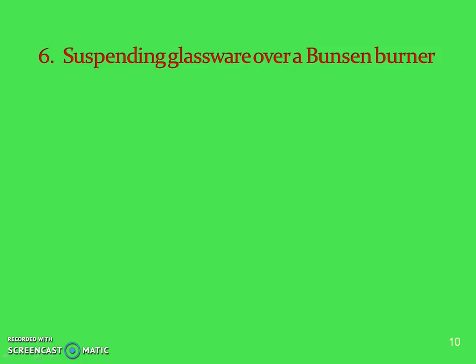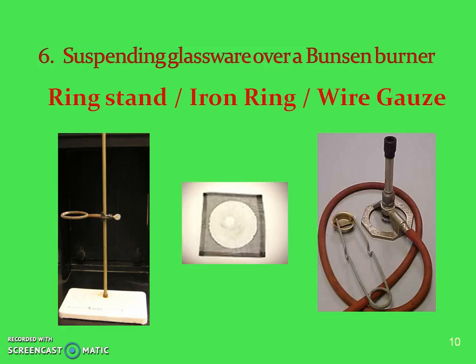How about if we are suspending or heating something using the burner? Again, you're going to use this ring stand, you're going to use this iron ring, and you want to use the wire gauze on top of it. Now remember, the wire gauze is twofold. One obviously is to keep the beaker on here for stabilization, and the other is, think about your kitchen, right?